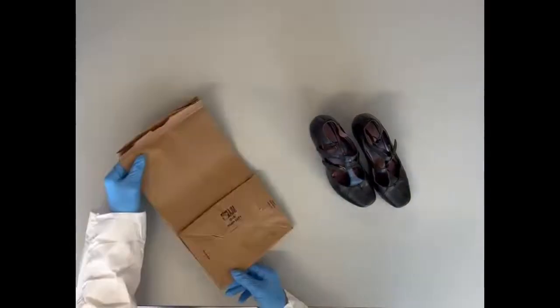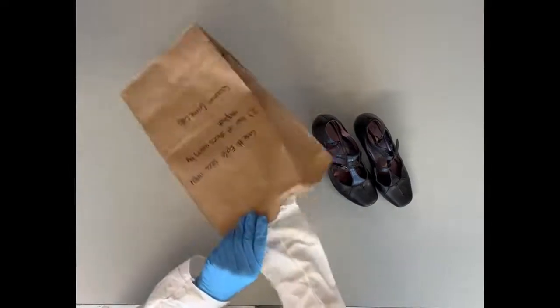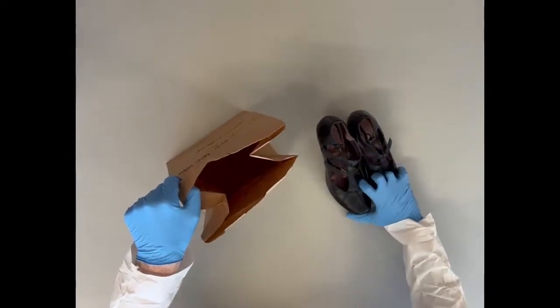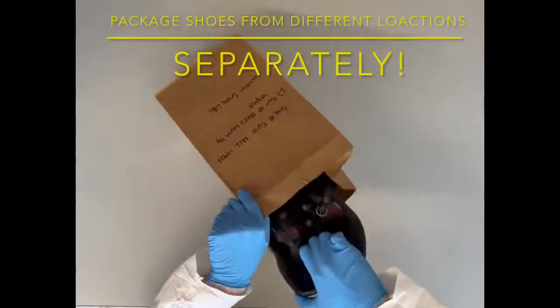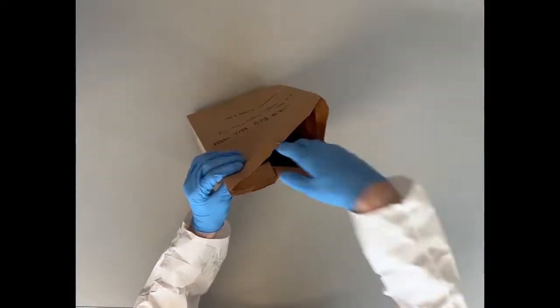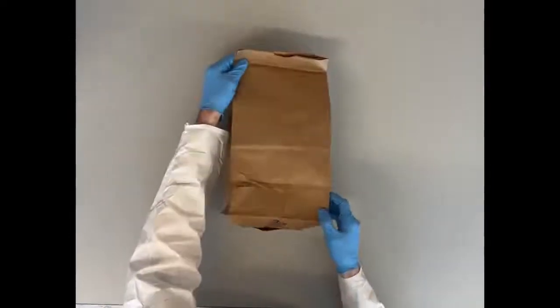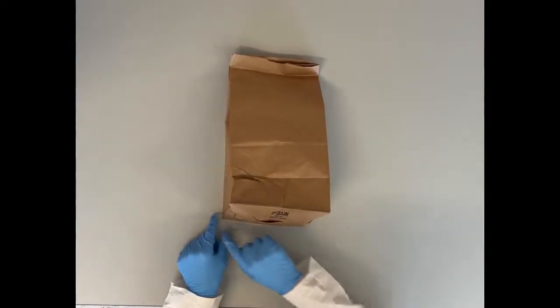When the shoes are dry, you want to take your pre-labeled brown paper bag and open it wide. Then pick up the shoes, either together or individually with a gloved hand, and place them into the open brown paper bag, heel first. There needs to be enough room in the bag for the DNA analyst to open and remove the item for sampling, possibly more than once.